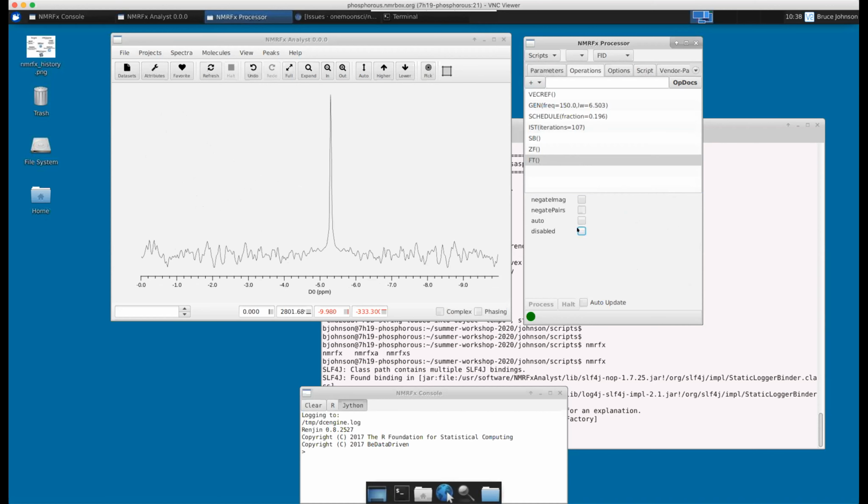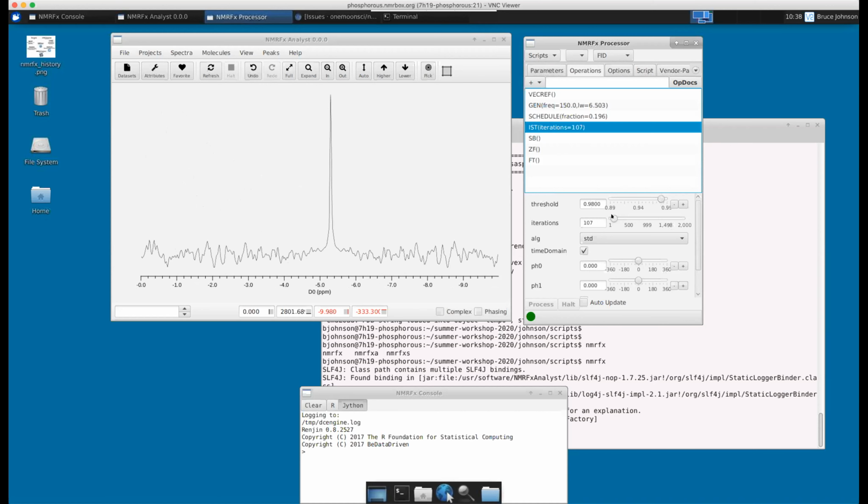I guess the effect in the FID, well, it still takes quite a few iterations, really 500, to get pretty good. I'm not sure if I'm actually answering your question or not. So the point is, both the methods you showed, is the reconstruction happening in the time domain before the Fourier transform is done, or is it doing the FT in an iterative fashion and looking for improvement?